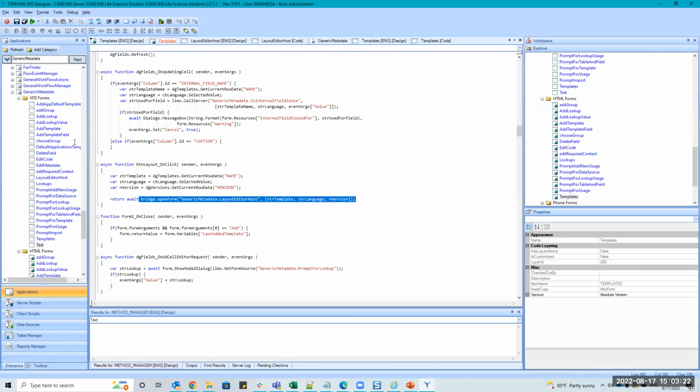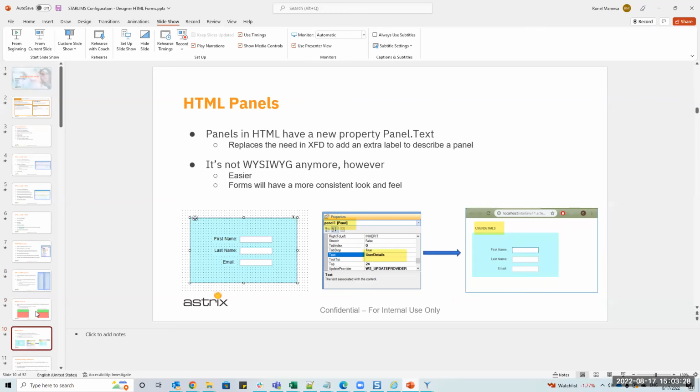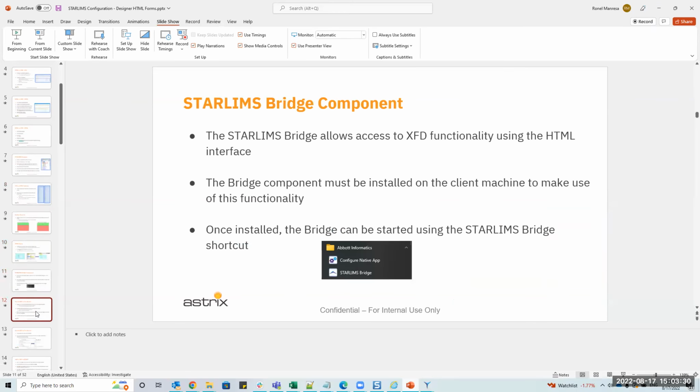Okay, so too advanced, right? Let's move on from that. But I don't even know how we got into that. I tend to do that. I think, oh, the bridge. Yeah, so I wanted to show you an example of what's happening when you click on a bridge. I so happen to pick a very complex example, but that's okay.